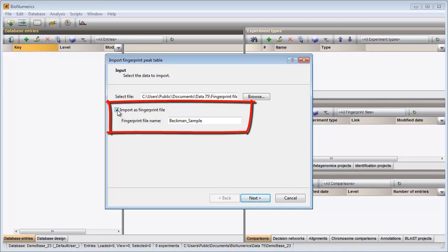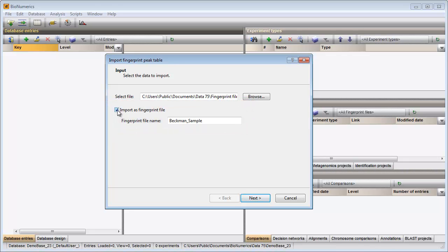When this option is not checked, the peaks will directly be imported in the database without creating any curves. In this example, I will check the option and specify a name.